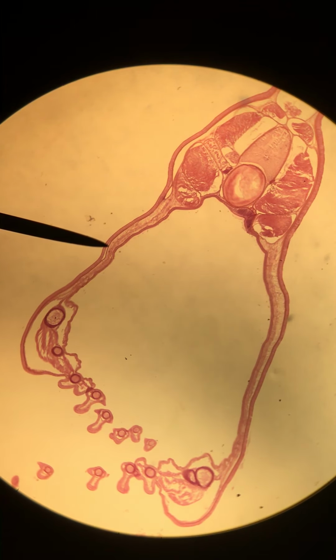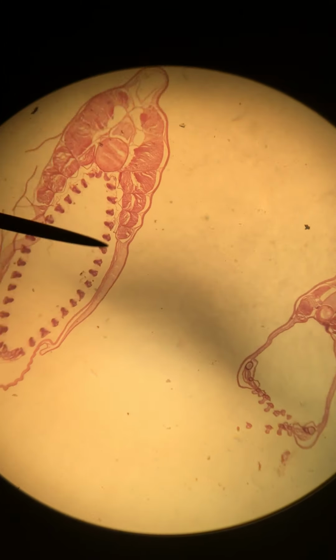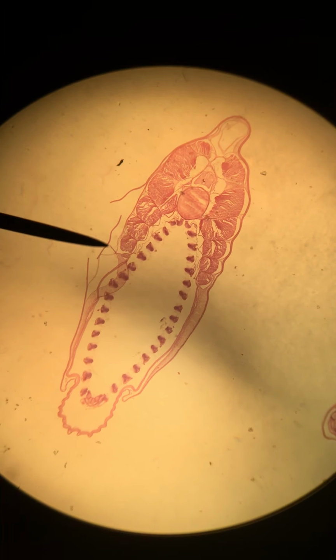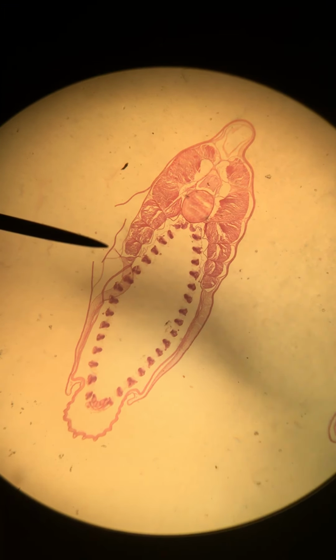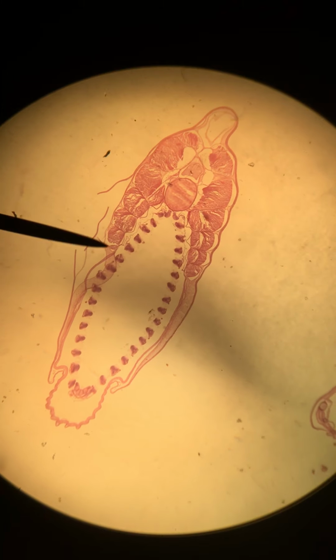So I'm going to decrease our magnification again, and we're going to move to our next most rostral section, which looks like this. This is sort of in between the two sections on page 23 in your lab manual. It's not as anterior as figure 10, but not as posterior as figure 11. So we'll get to figure 11 next. But this is a transition cut, so you should be familiar with what it looks like.